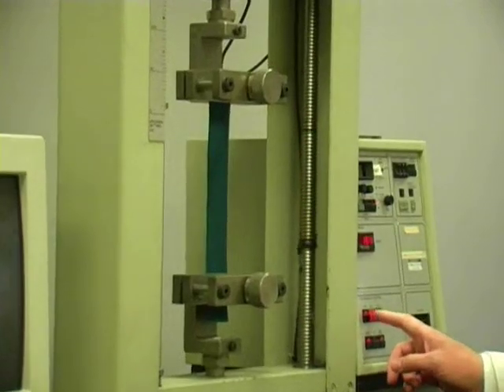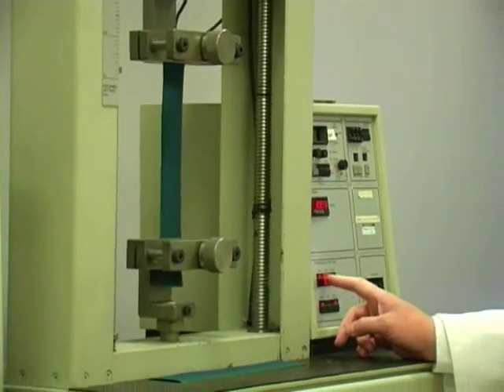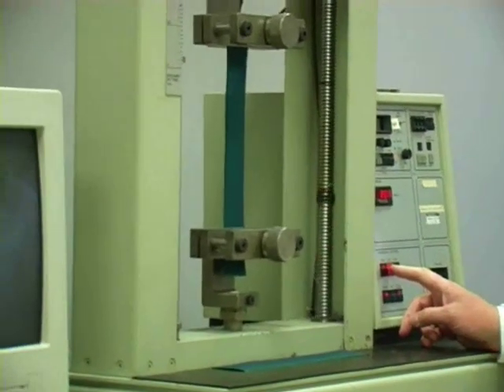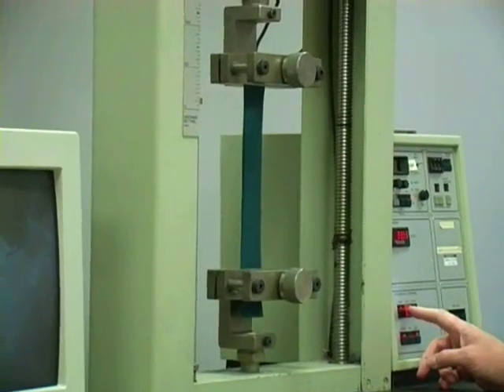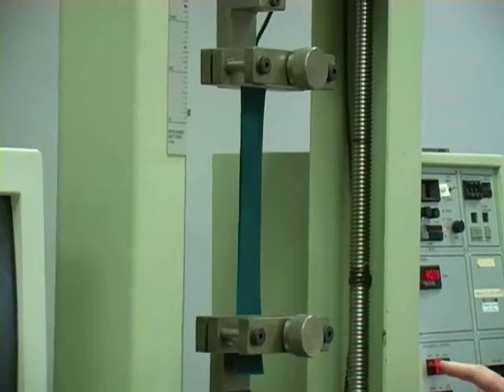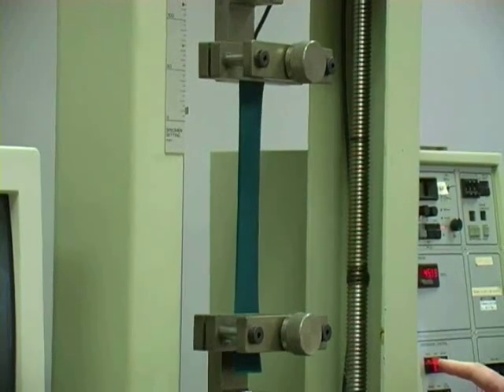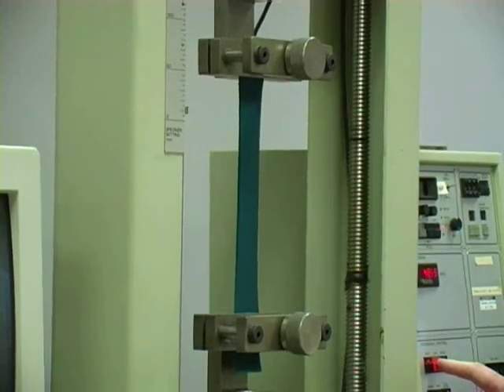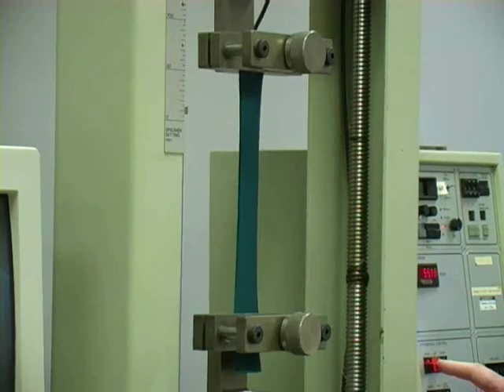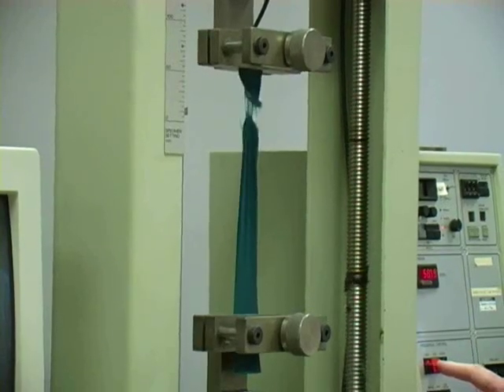I'll put my finger by this stop button here and when the fabric sample breaks I'll stop the test. 60kg force, 70 — it should break about 100. 85 — there we go.